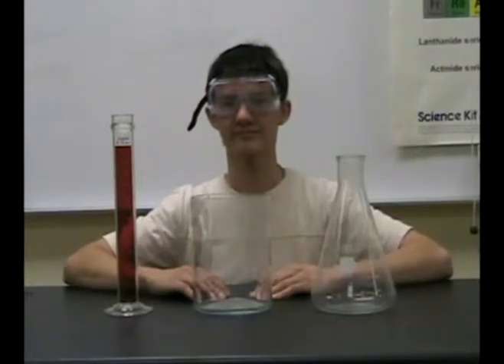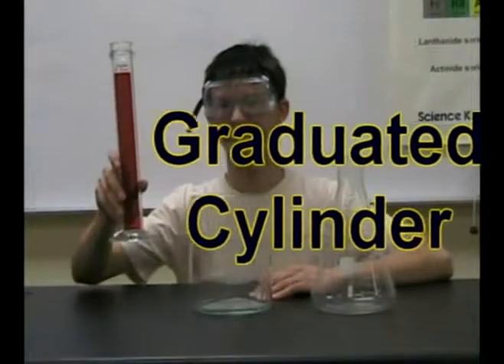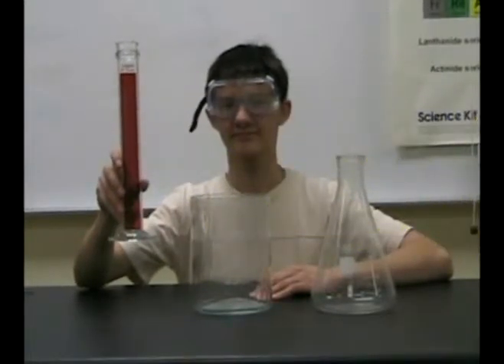The next instrument we will be showcasing is the graduated cylinder.